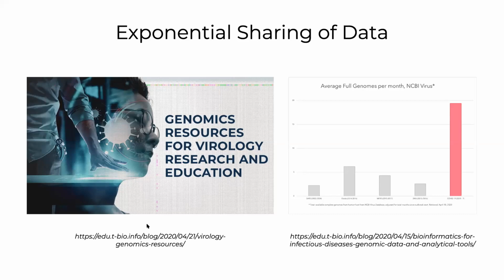Some of those technologies, like Oxford Nanopore, can contain a lot of mistakes along the way. It's useful that the reads are very long, but it's not as useful because each position is less reliable. But a combination of these types of technologies, including the traditional real-time PCR, RT-PCR techniques, to really determine the full sequence of a genome, are used to produce a reference genome.